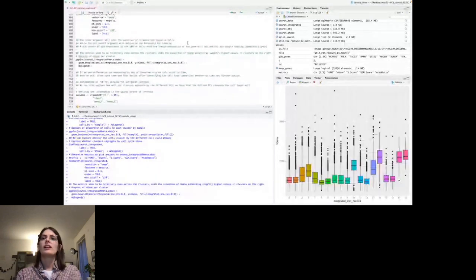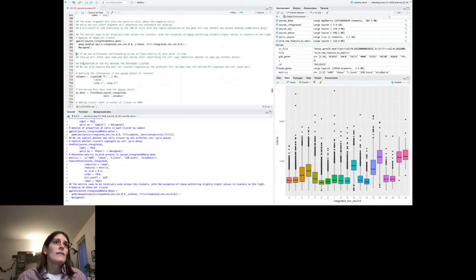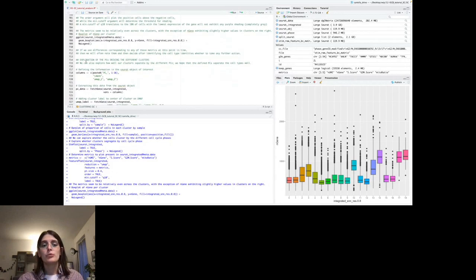Okay, then here I also put some code. These are all graphs that help you understand your clusters. These represent the number of genes expressed in each cluster, and it can give you an idea of the richness of the transcriptome in each cluster. And if we see any differences in any of these plots that are driven by unwanted variation, this is the time to go back and refine the clustering, or we need to add some covariates to regress out.